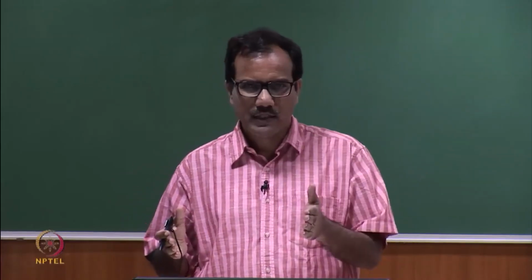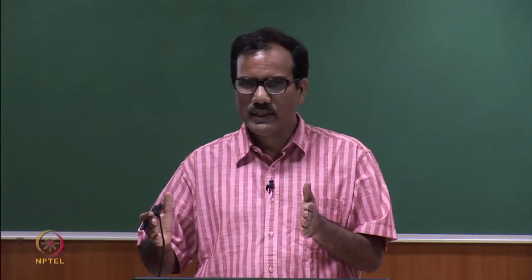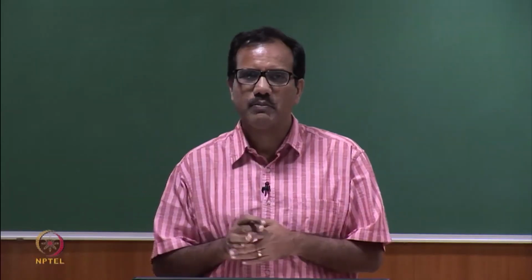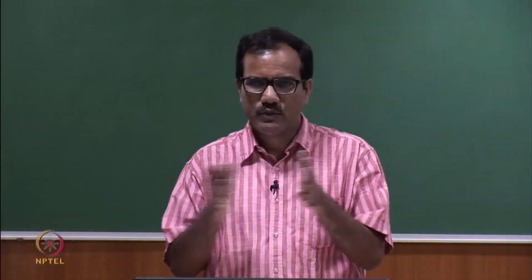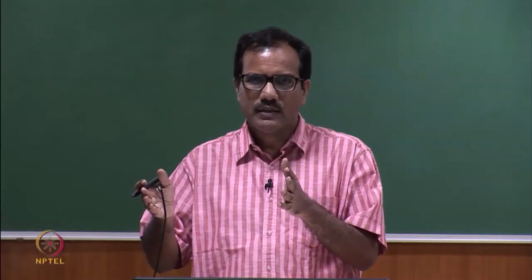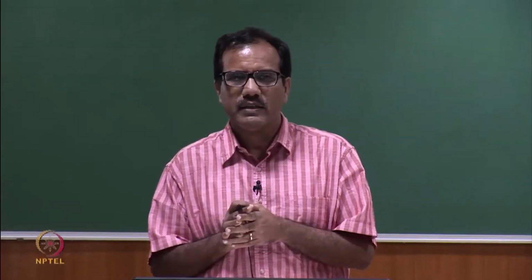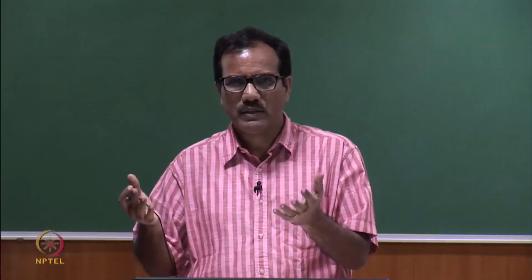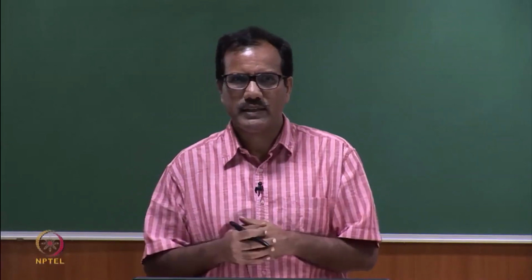Suppose the decay started from this point and lasts to this point, then we need to measure several points in between. But since it is too fast, in one excitation and one emission cycle it is very difficult to get 10 points between the initial start and the final decay.